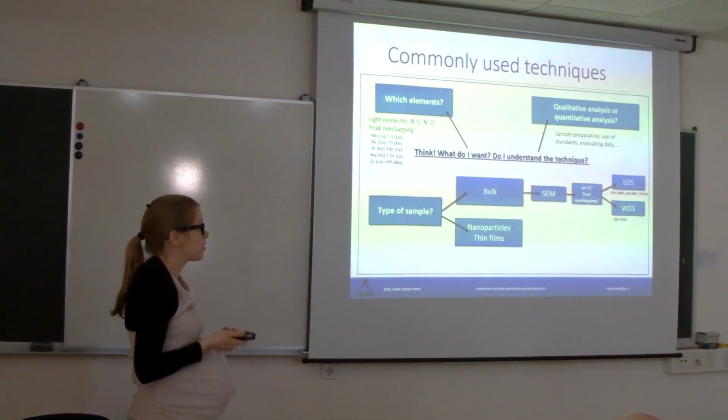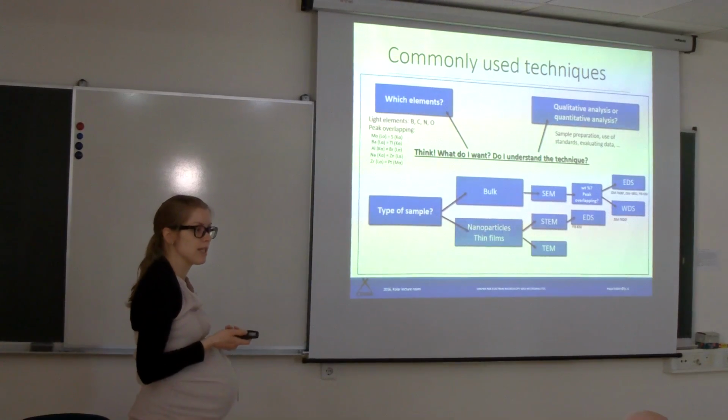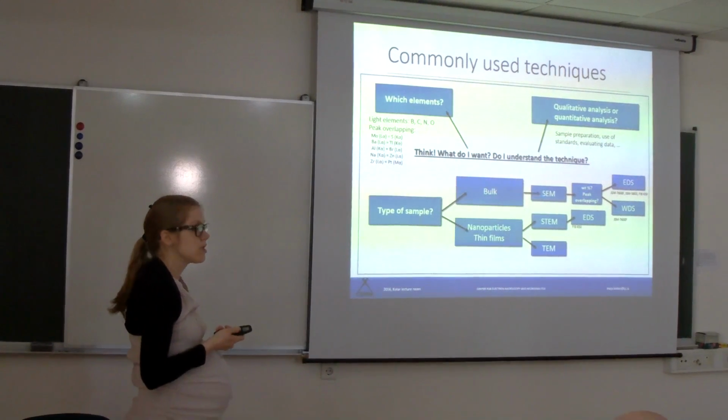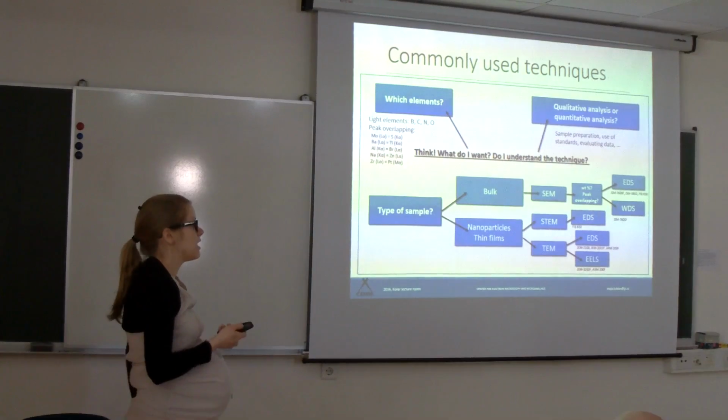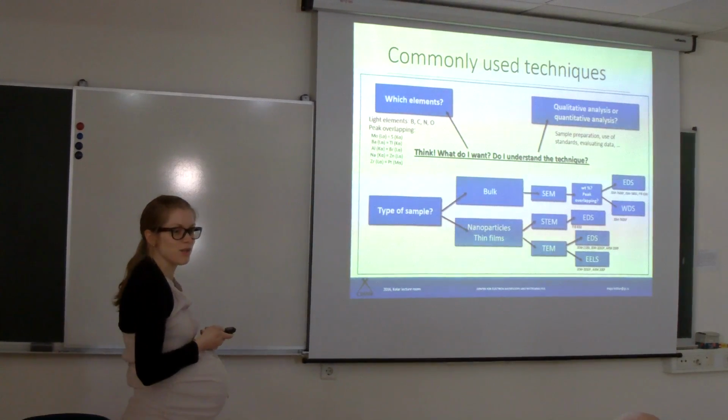If you have nanoparticles or thin films, you may choose the STEM unit, which has the EDS on the FIB, or you can use TEM. So you can use EDS or EELS. And here are three TEMs, so one in the Chemical Institute.